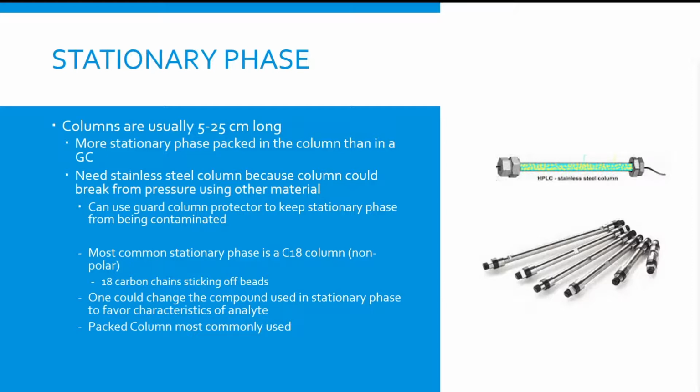So now that you know how the column is structured on the outside, I'm going to discuss the stationary phase. And basically, that is what's packed on the inside of the column.